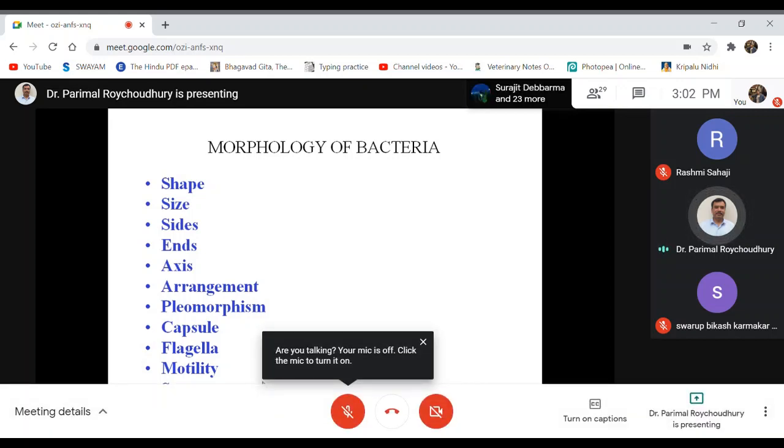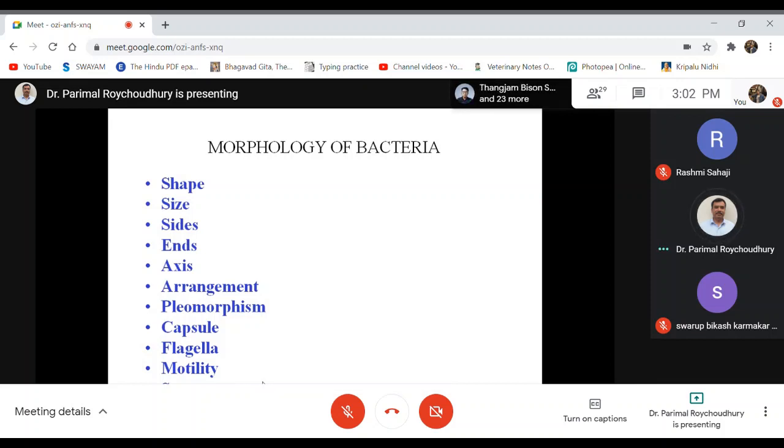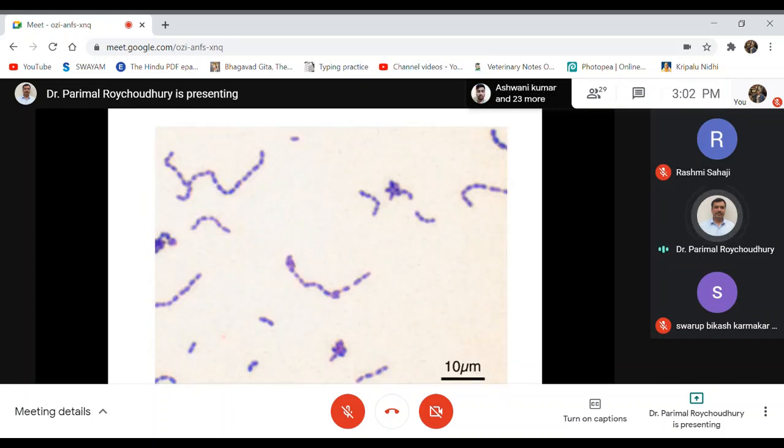In the subsequent slide we are going to see this commonly used process of identification of bacteria. Practically, you need to learn it in the theory class and practical classes. Let us randomly see some morphology and staining characteristics of bacteria.